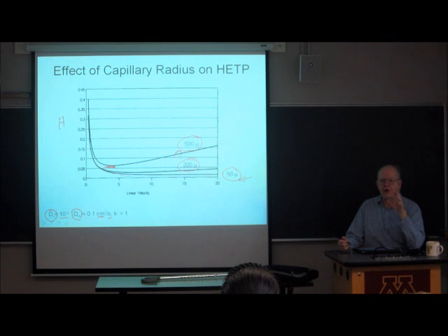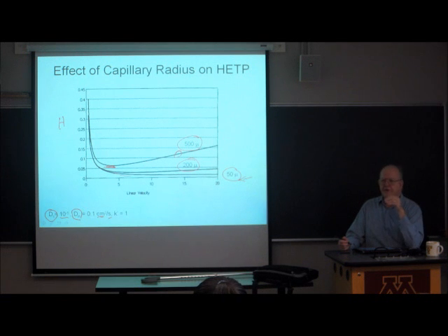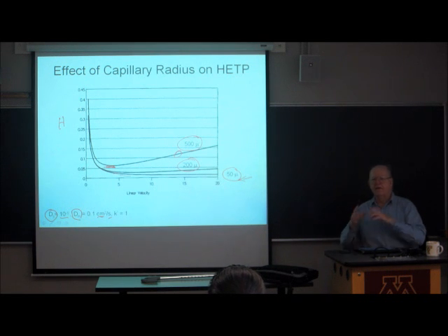Gases have low viscosities and high diffusion coefficients. Liquids have high viscosities and low diffusion coefficients. And we're talking 3-4 orders of magnitude in viscosity and 3-4 orders of magnitude in diffusion coefficients. The biggest single difference in the behavior of GC and LC comes from the viscosity of the fluid and the diffusion coefficient of the analyte in the gas fluid versus the liquid fluid.